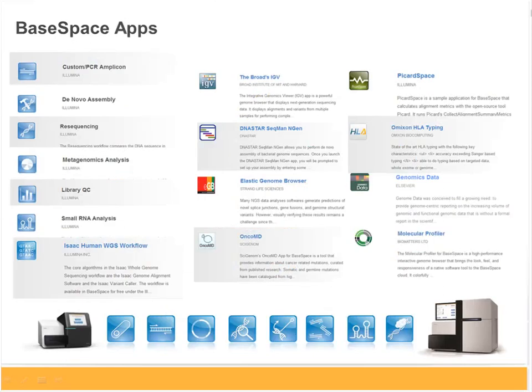As you see, we've included many new apps, and we're adding more every day. On May 15th, we've included several new applications, plus we introduced iCredits. One iCredit is equivalent to $1, and this enables not only the free apps that we had before, but also now paid apps as well.